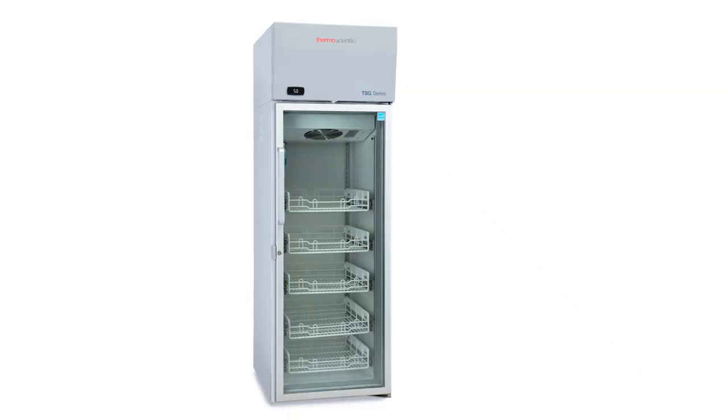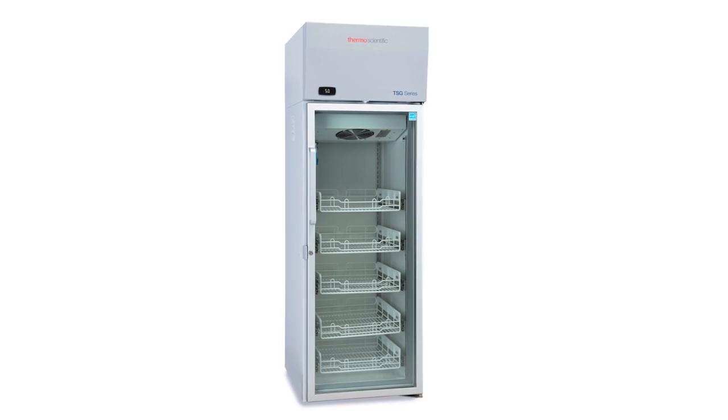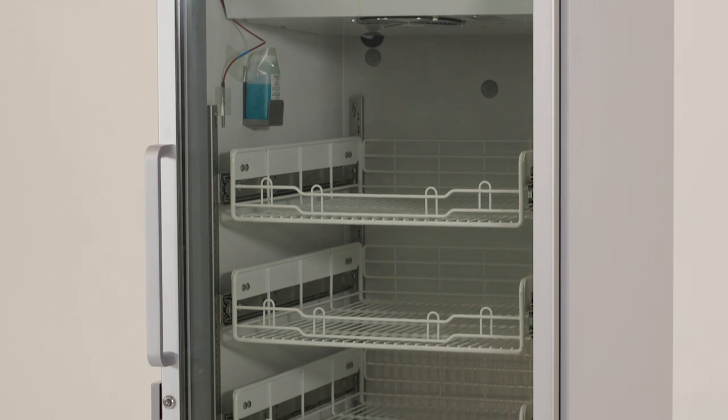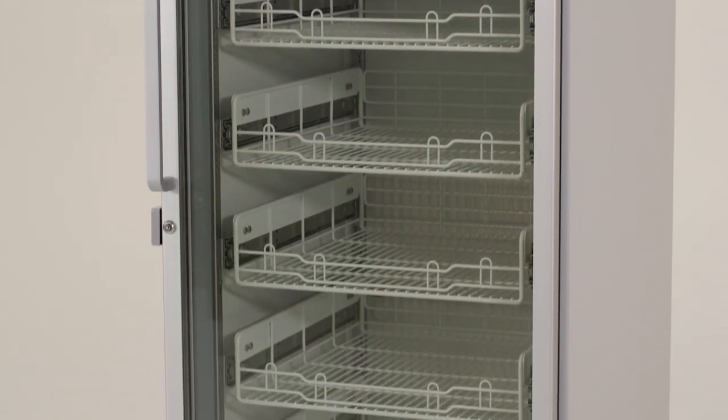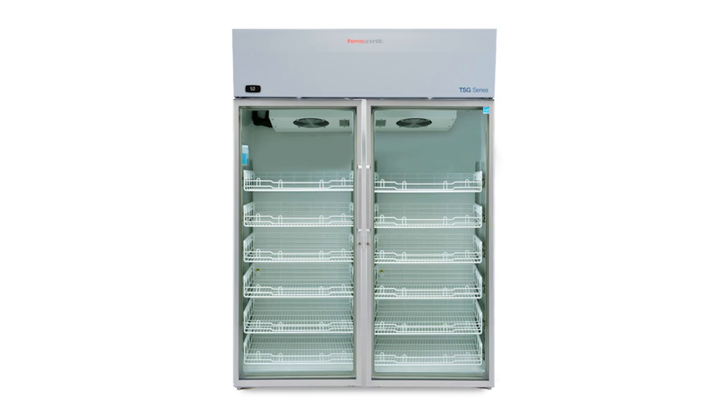Pharmacy refrigerator baskets are pre-installed at the factory. Pharmacy refrigerators with a 12 cubic foot capacity have five baskets. Pharmacy refrigerators with 23 and 30 cubic foot capacity have six baskets, and 50 cubic foot models have 12 baskets.